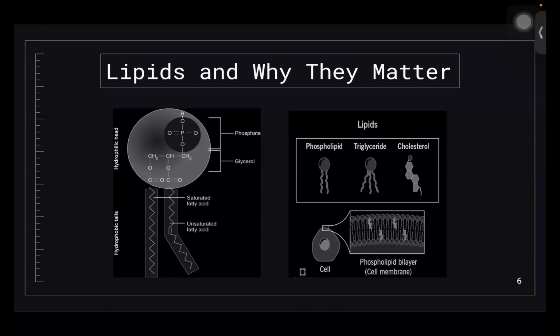I said I wanted to investigate heterogeneity in the pancreas, and I'm going to be comparing lipids in the pancreas to do that. Why? Well, because the multimodal imaging mass spectrometry that's used in the lab can provide us with that information, can help us analyze the lipids and help us identify the lipids within the pancreas.